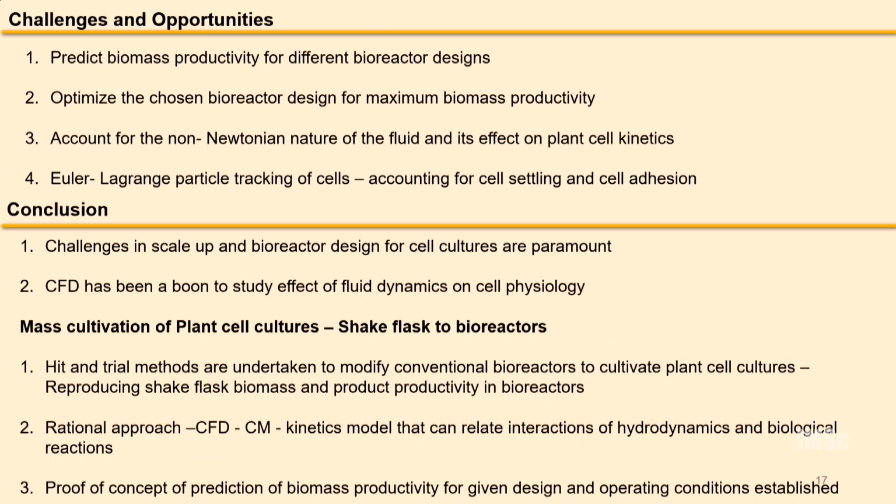So we have looked into a rational approach, the CFD based compartment model kinetics, which can relate the interactions of hydrodynamics, or the effect of hydrodynamics, on biological reactions. So in this proof of concept, for the given design and operating conditions, we were able to predict the biomass productivity. So this can be replicated for an optimization of which is the best design for biomass productivity for any culture, if we know the biomass kinetics.